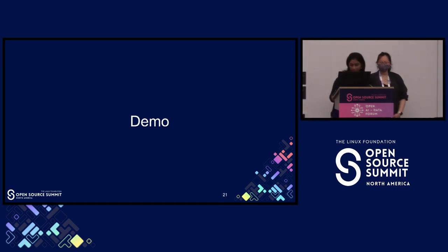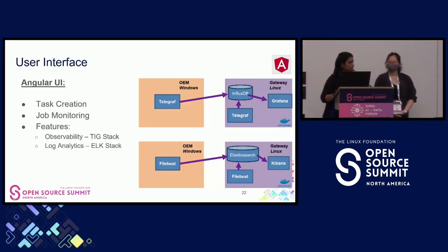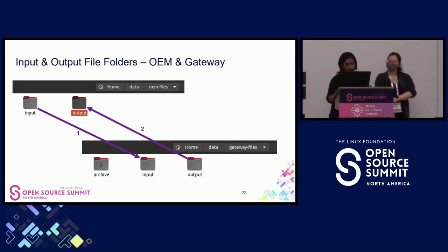Thank you, Elizabeth. So before we move into the demo, I wanted to touch base on a few points. The first one is our user interface. We built it on top of Angular UI. This will allow our customers, which is bench scientists, to create tasks, monitor the jobs, and we also added the features for observability and log analytics. The second thing to note here is the input and output file folders that we have on our file system for both of these machines.